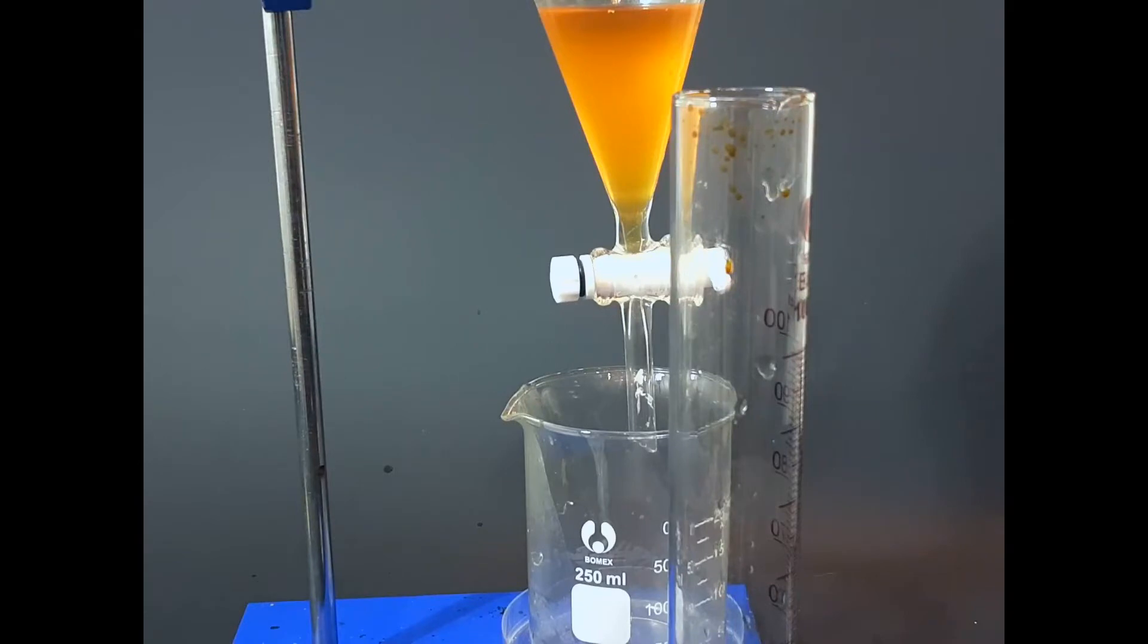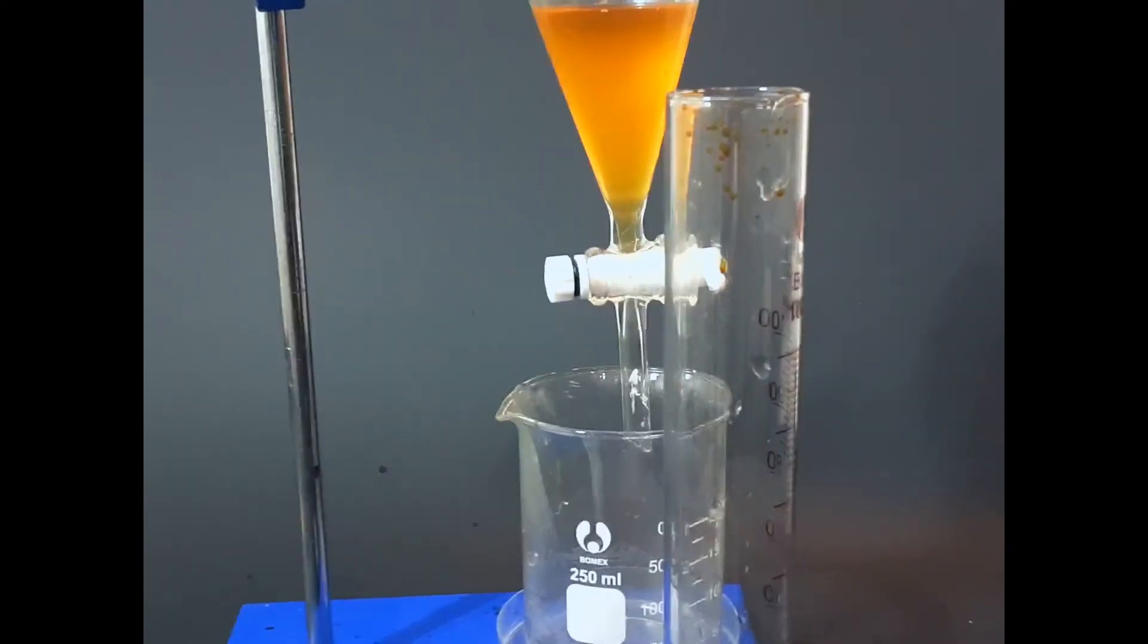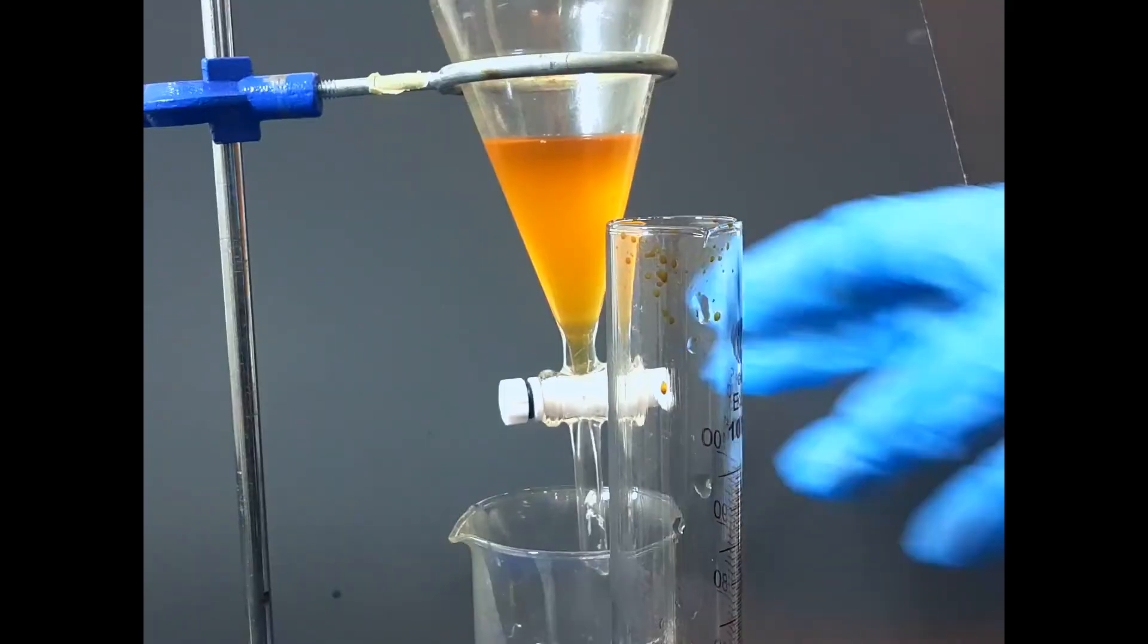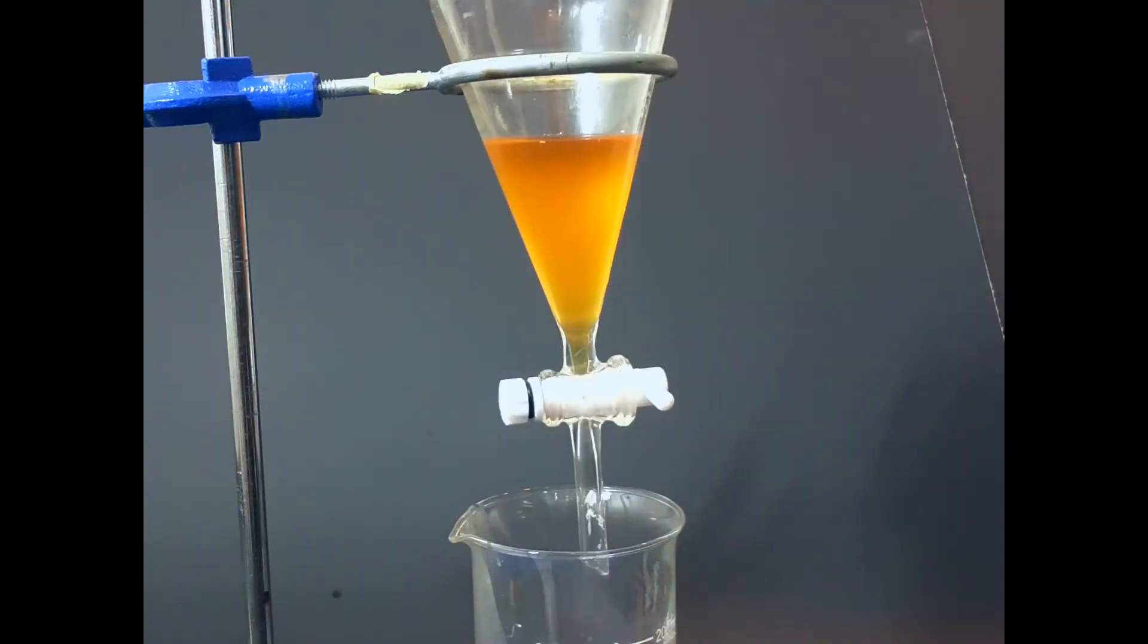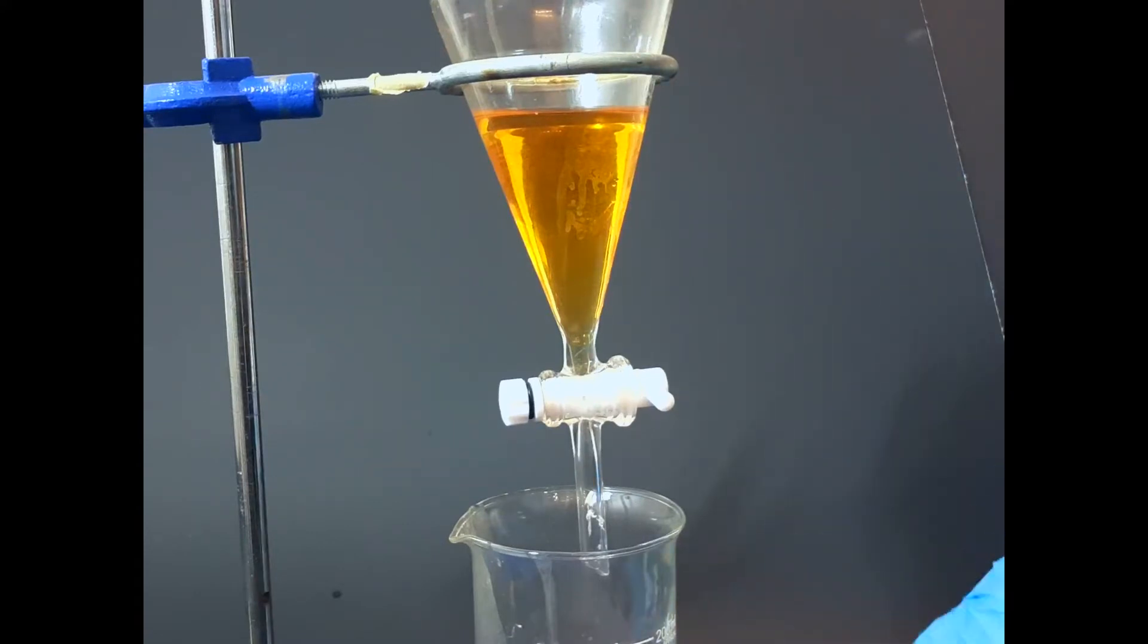I'm now starting to prepare to add the DCM. I grab a separatory funnel—you can't really see it because of the camera angle, but I do have one. I slowly pour it out, and then I kind of realize that, once again, I need another beaker because I spilled some of the DCM again.